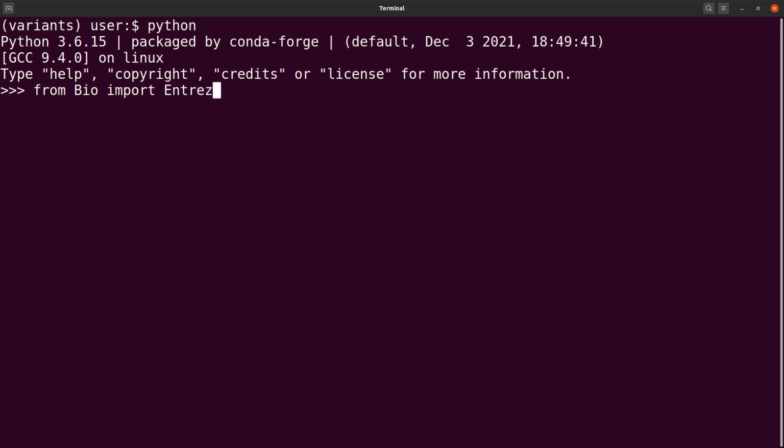So we are using the BioPython package. With the BioPython package, we have the Entrez and then the SeqIO modules. These are the two modules we will use to get the genome. With Entrez, you also need to supply it with your email address. So we say Entrez.email equals bioinformaticscoach@bioinfo.com. So it should be in quotes.